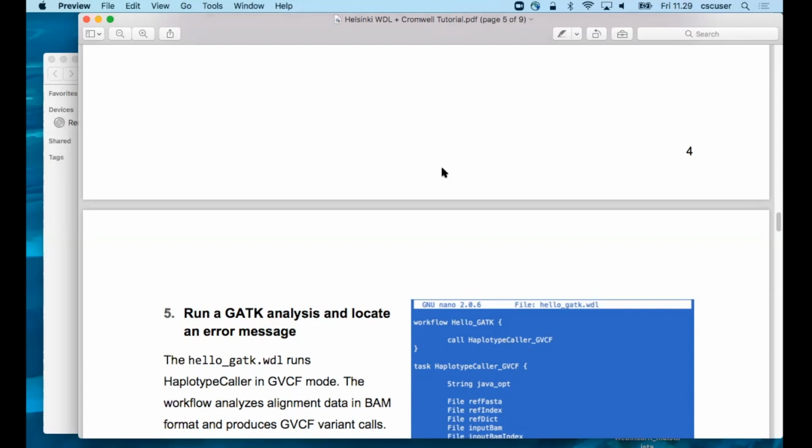All right, well, these are live demos, but anyway, WomTool has more commands. Can you also share with them the link to a documentation that will help them walk through this? Sure. If you go to cromwell.rtfd.io, this is Cromwell's documentation. It tries to be complete. There's a lot of things covered. If you have questions, GitHub's a good place. We try to make this pretty good.